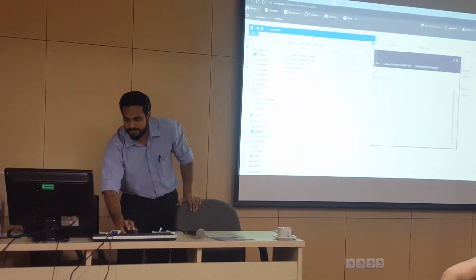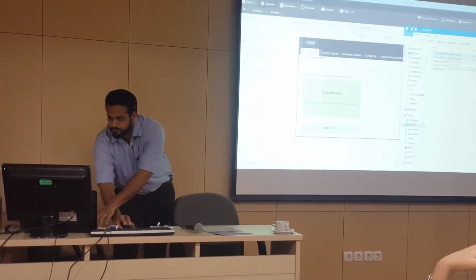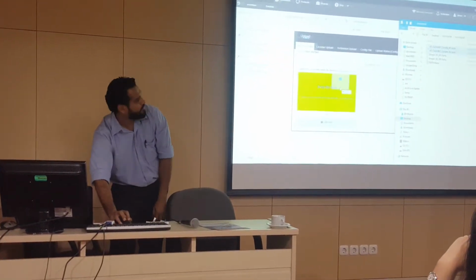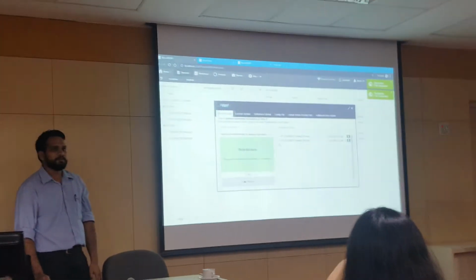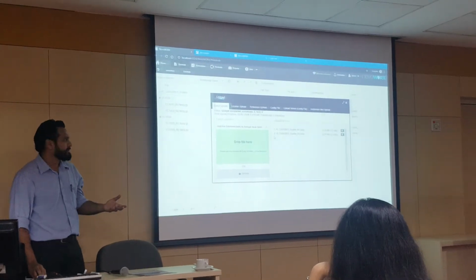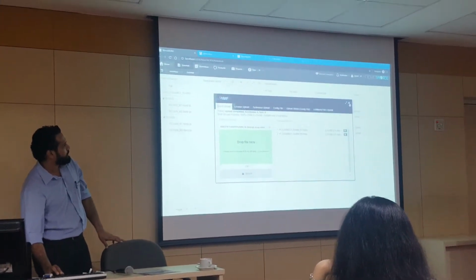And it will show you the progress of your upload, how long it's going to take. Once it's done, you just have to click OK, and your data will be shown here.